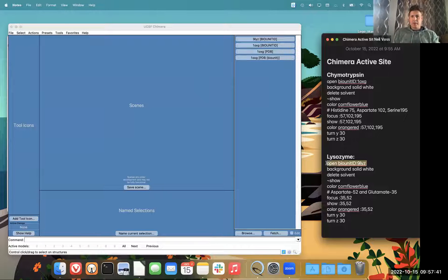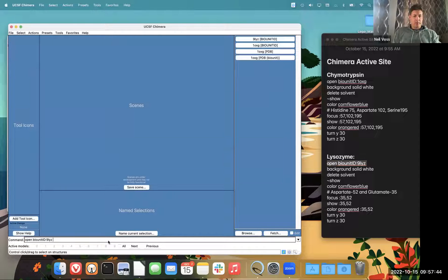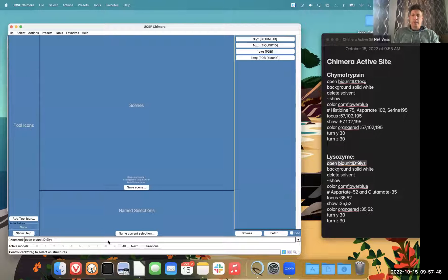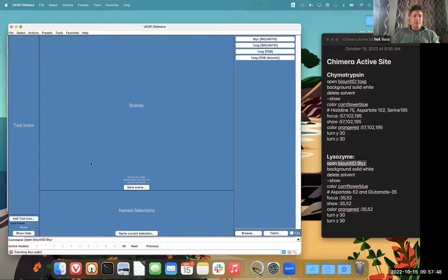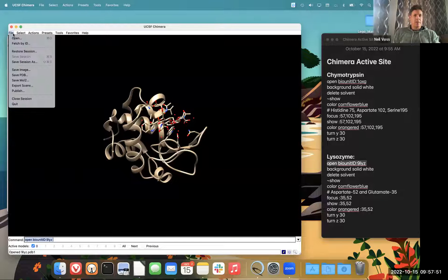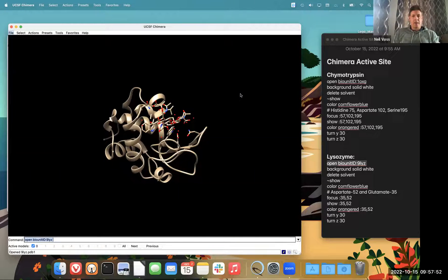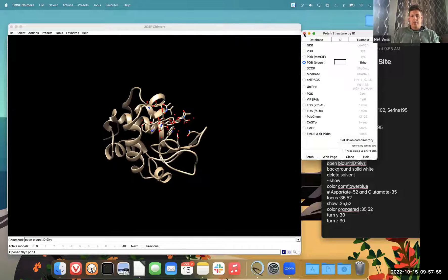So I've copied all the commands. First, I want to open up the bio unit of 9LYZ. This is a different assignment than the assignment for my biochemistry students. It's just the equivalent of going fetch by ID and then clicking PDB bio unit.